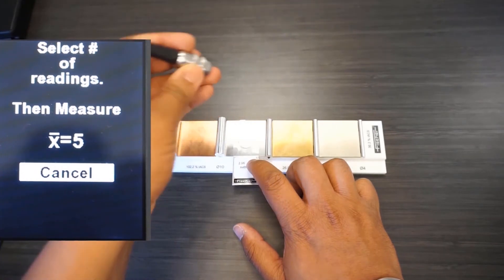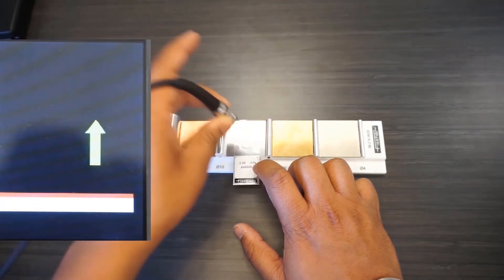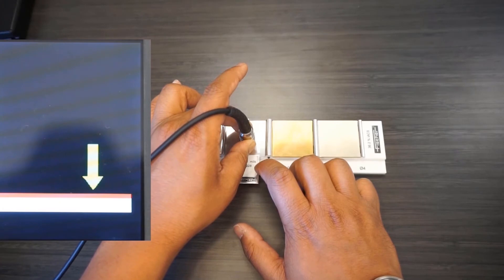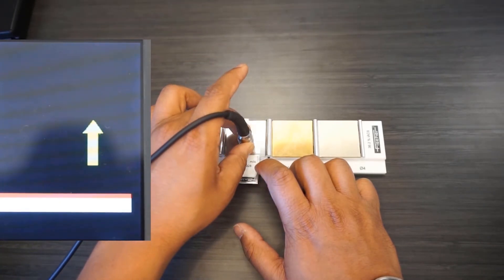And then five more on the certified foil. Notice how I have to hold the probe down for a little longer — I'm not sure if I'm doing something wrong or it's the unit.